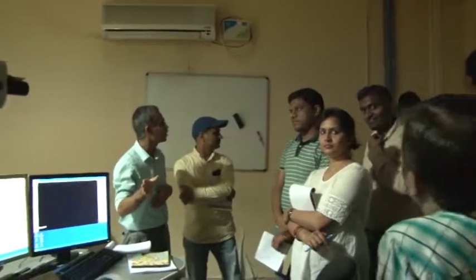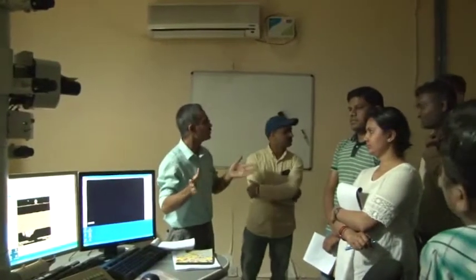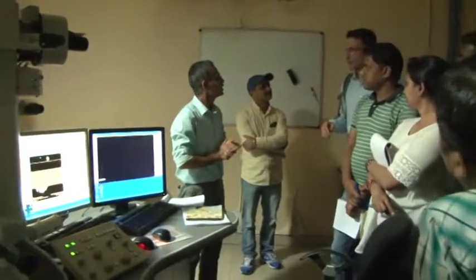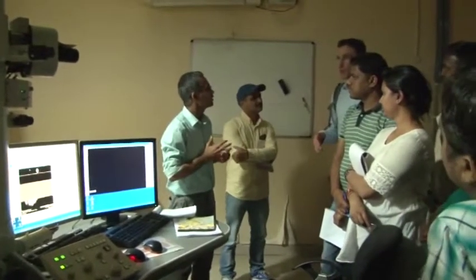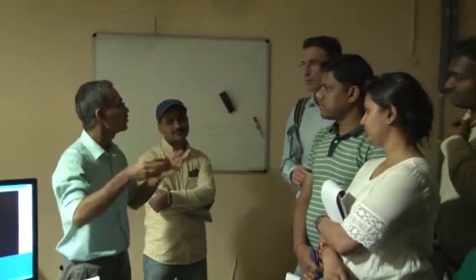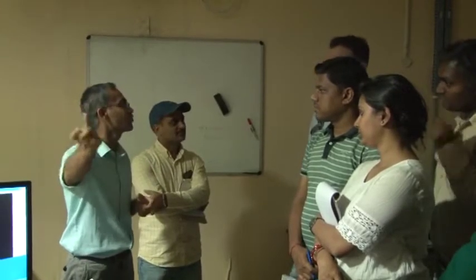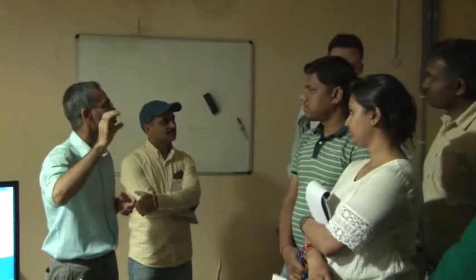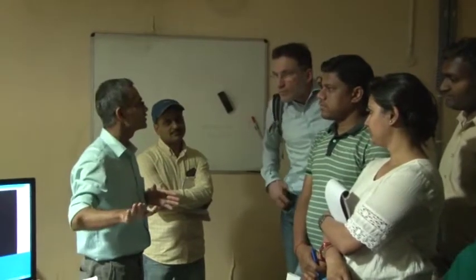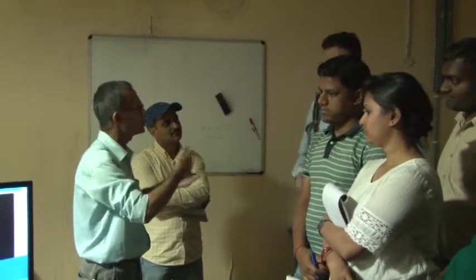The sample is still the gold nanoparticles, and we didn't change it. The gold nanoparticles were inserted right from the beginning, because we thought for aligning the microscope it would be better. We stayed with that, and let's stick to this for the time being. If needed, we will change the sample.